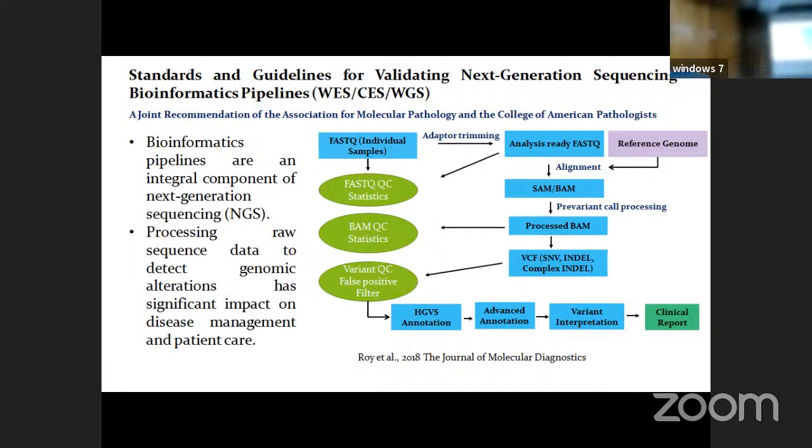When you are using NCBI BLAST, you are doing local alignment, right? When you are using the Needleman-Wunsch algorithm, I'm not sure how many of you are aware, you are going for global alignment. Or the Smith-Waterman algorithm for local alignment. You are doing that. But here, there is no real sequence. There are reads, small fragments. So that's why it is called mapping.